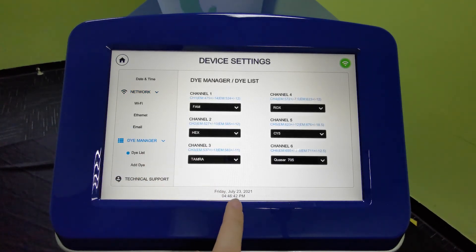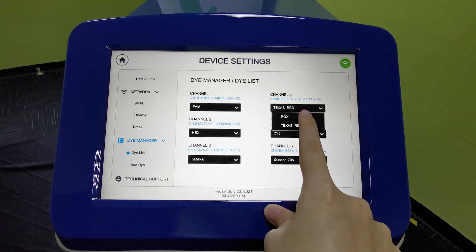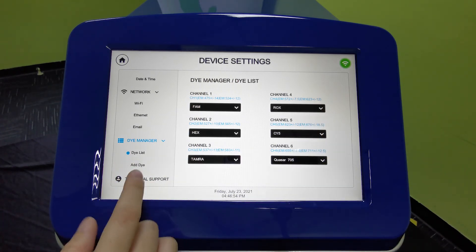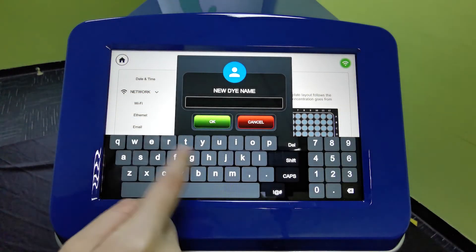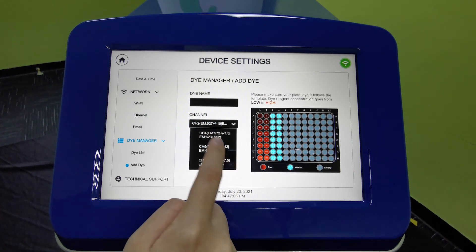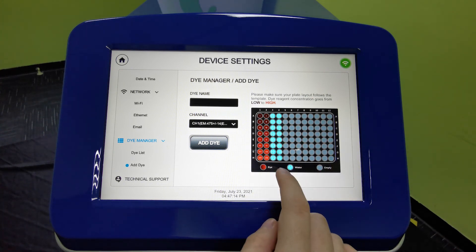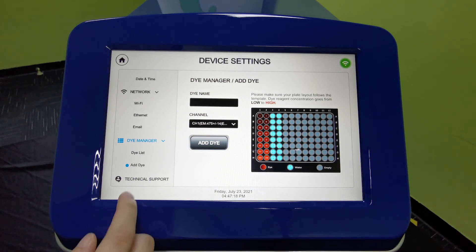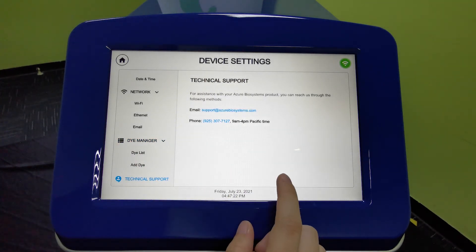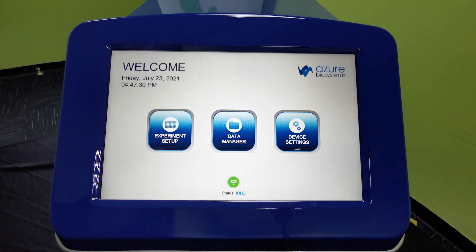Under Dye Manager, this is the dye list shown earlier when setting up your protocol. You can change the name of a dye in a given channel. If you have a custom dye, click Add Dye, enter the dye name, and select the channel it will use from the preset channels. This is a guide for testing your custom dye — you can also find this in the user manual. For technical support, you can email support at azurebiosystems.com, or contact your local support from ExoScientific in Singapore. This concludes our demo session — thank you.